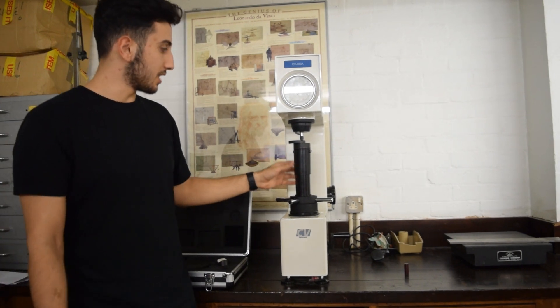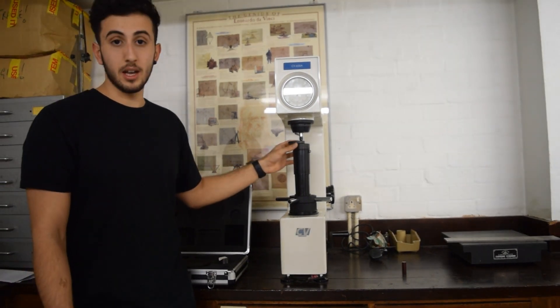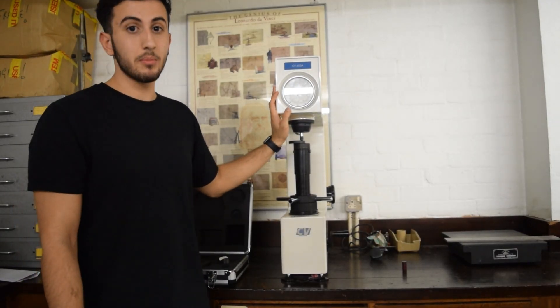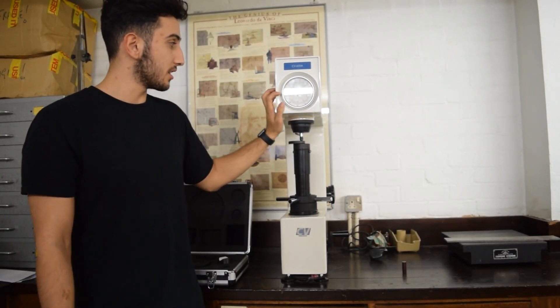From this specific test that we've done, we have this material and it's given us a number on the B scale. That number represents the Rockwell hardness number. It's also very good to do this test three to five times just to get a good average for the hardness of the material.